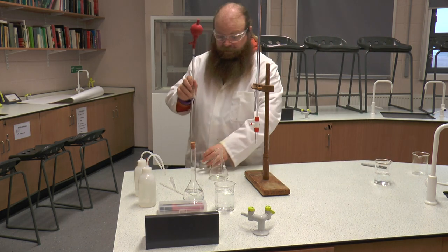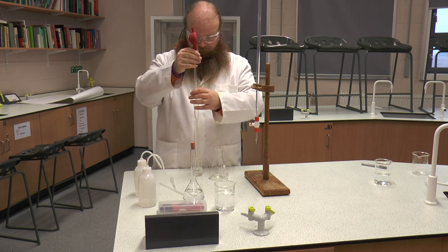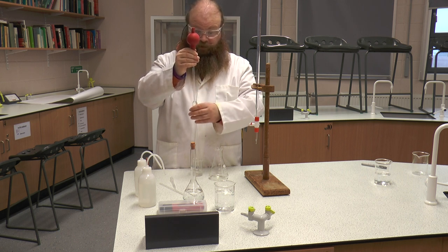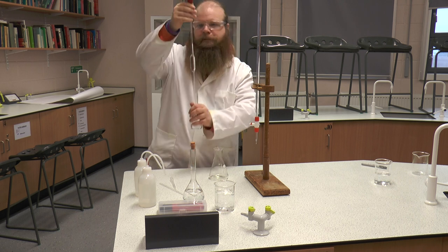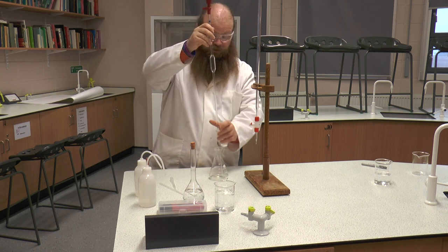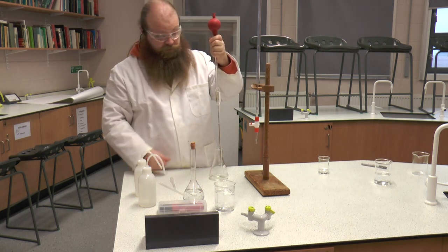I am now going to again pipette out my 25 cm³ of sodium hydroxide, following exactly the same method — putting the pipette below the level of the solution, emptying the pipette filler of air, and then using the suck button to draw up the fluid into the pipette. I am then going to check that, at eye level, my meniscus is on the line, which it is. And then I am going to use the empty button to empty out the sodium hydroxide into the conical flask.